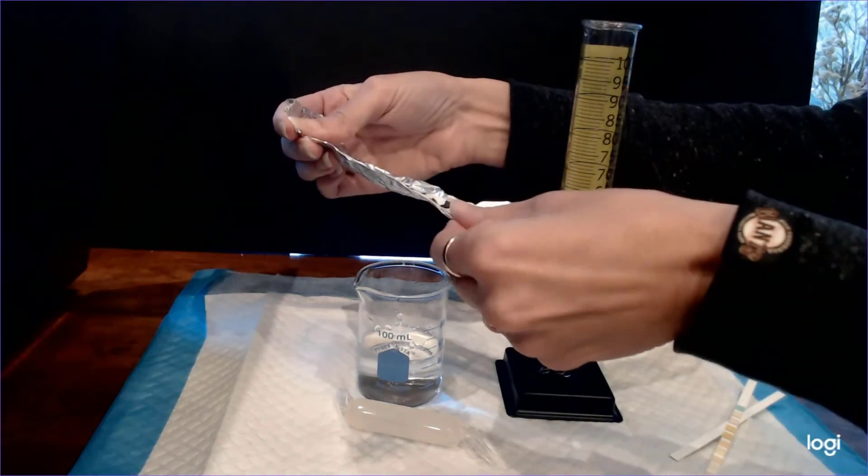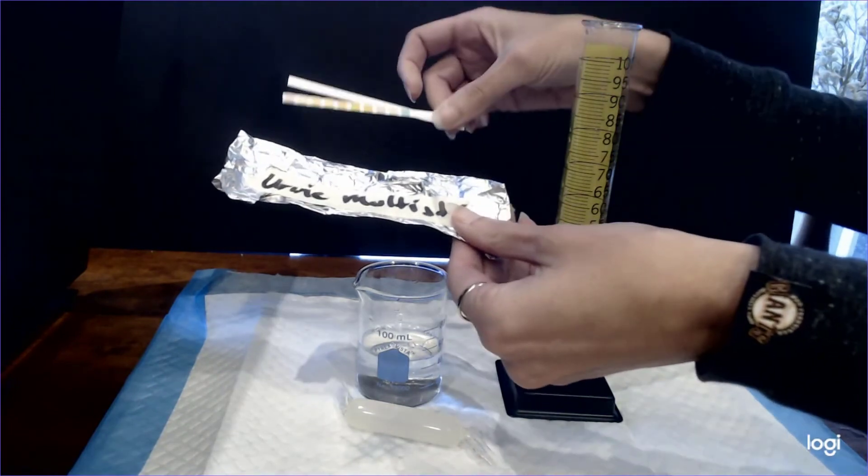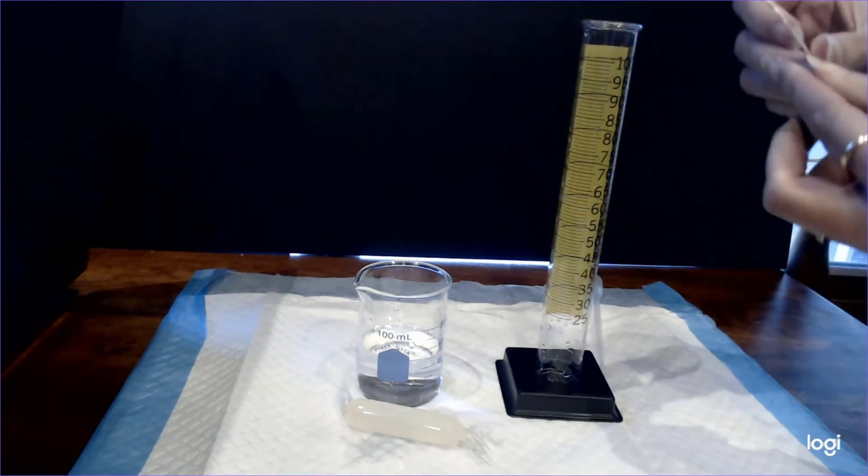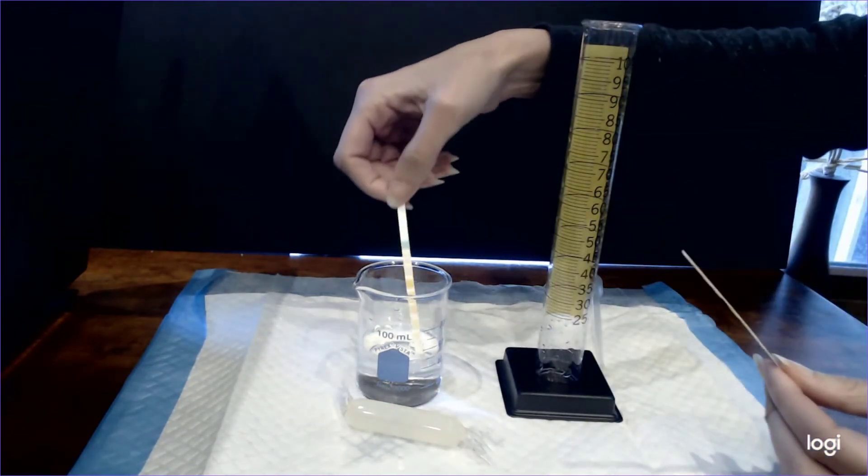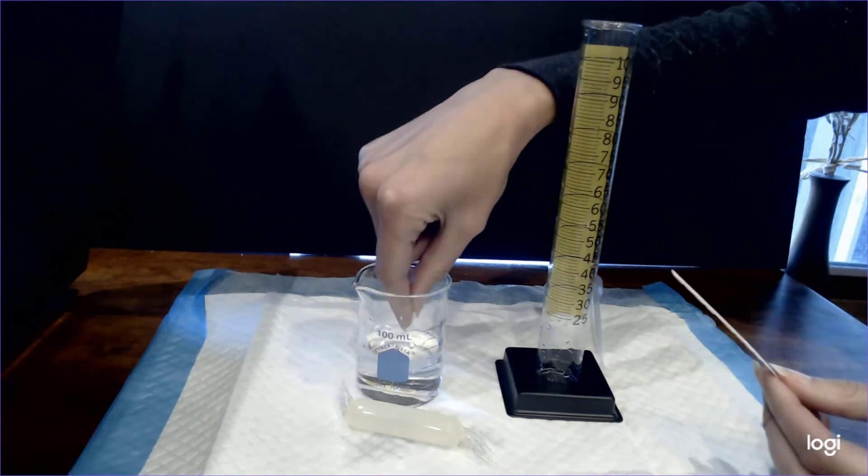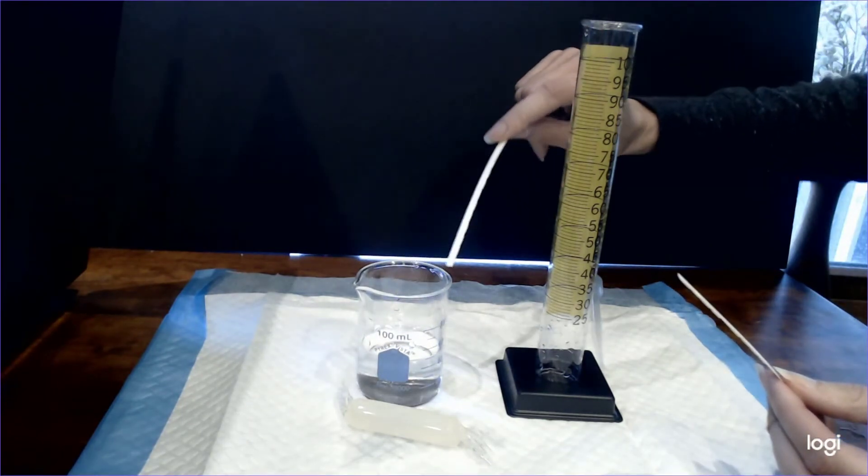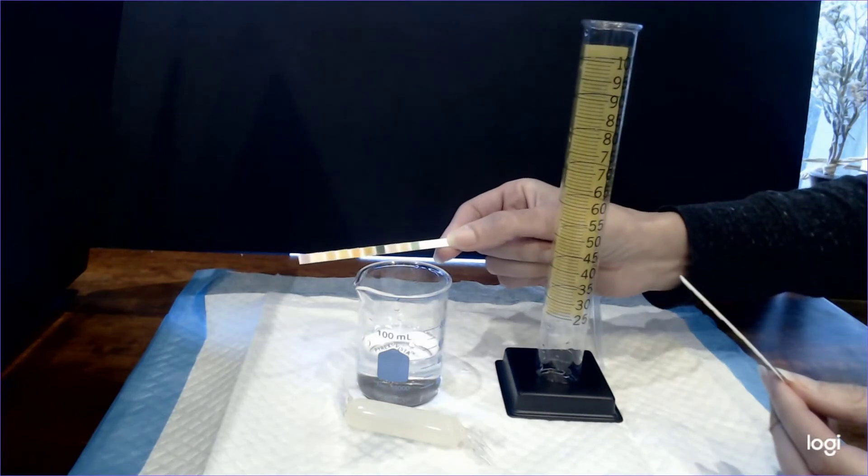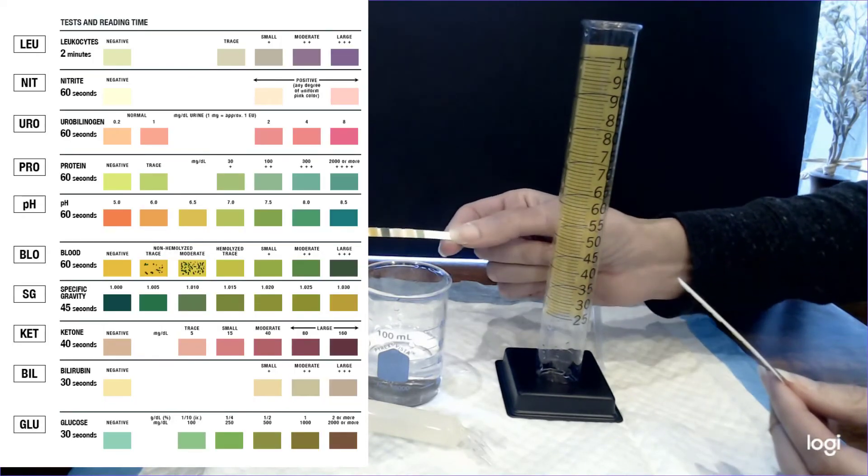We're going to take one of those dipsticks and we are going to dip it into the beaker so that every pad gets wet, and then we can go ahead and compare what we see on the dipstick with a color chart that is shown here.